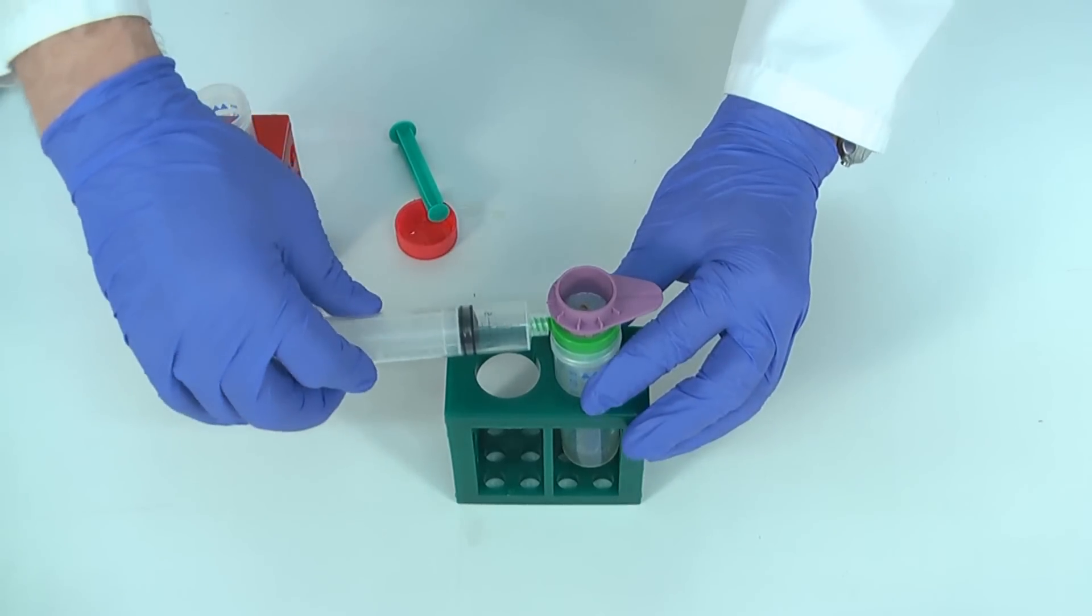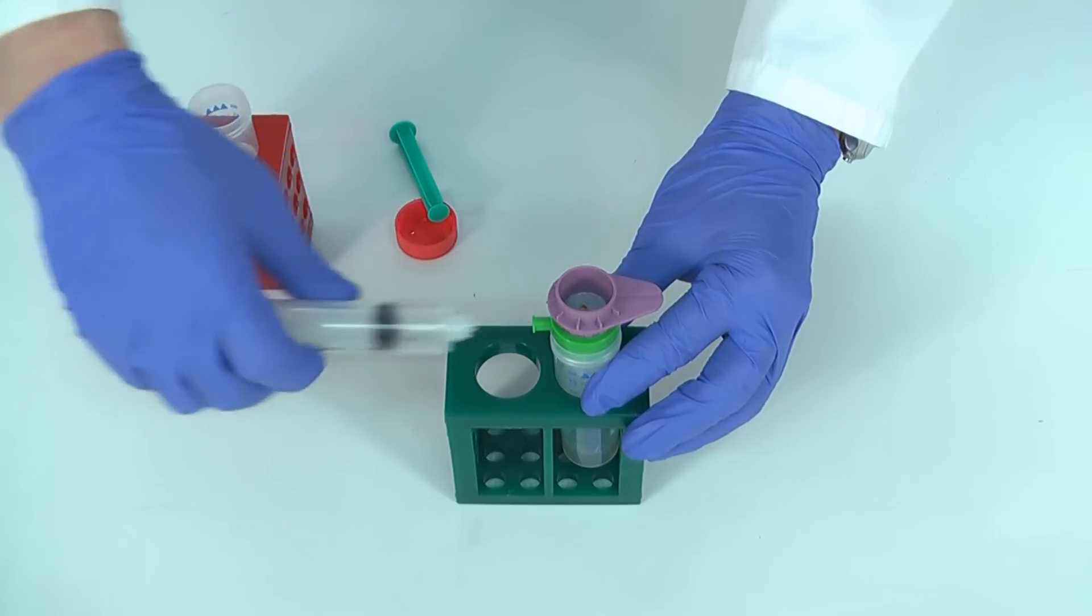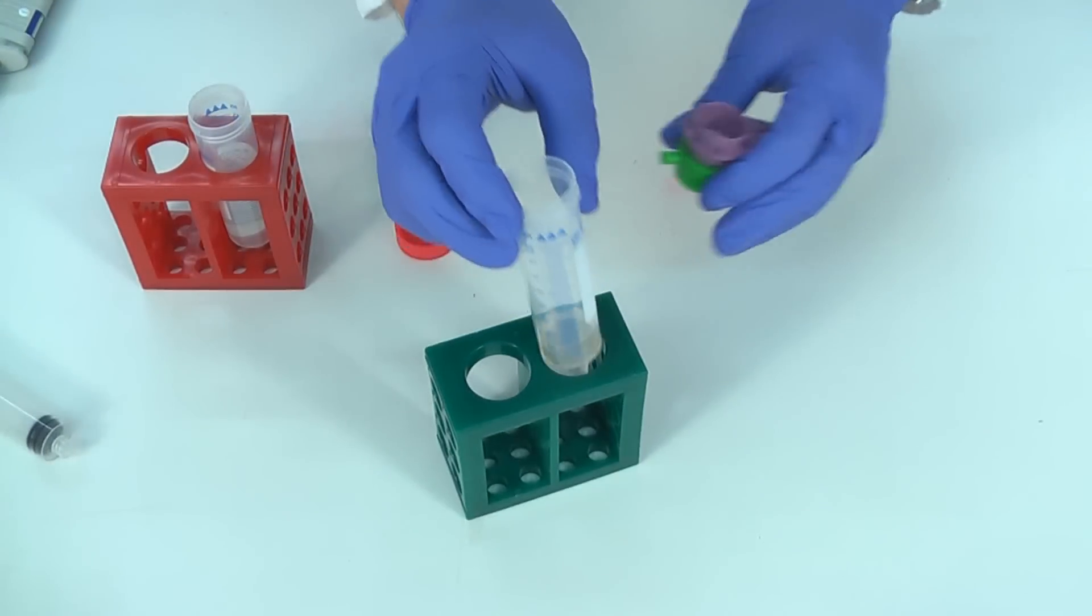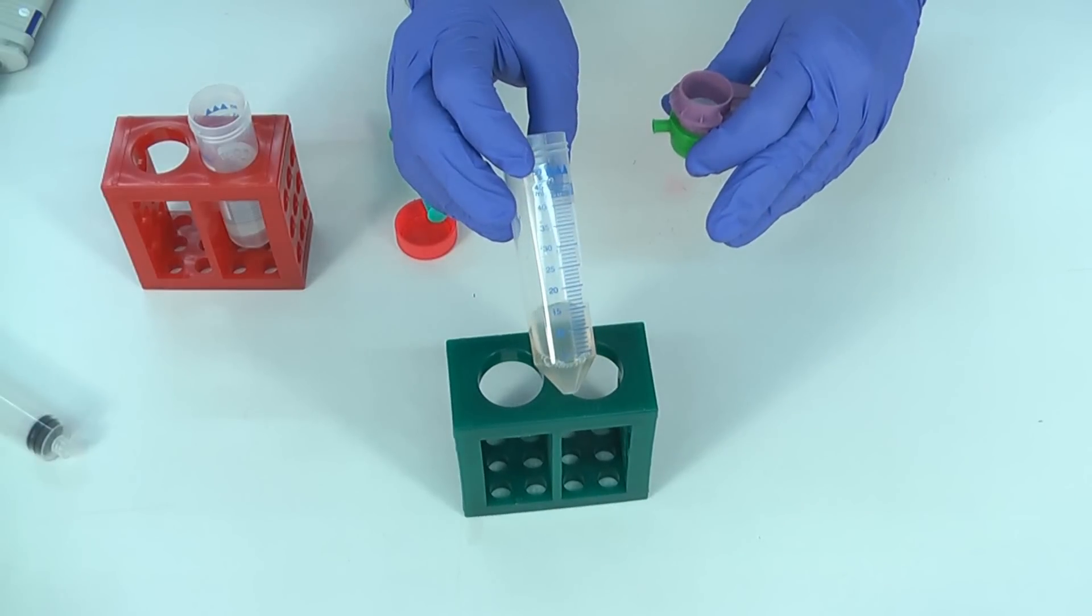Finally, you have your spleen cells in the tube below. You can use them for further application. For example, for cell separation with our pluriBead system to isolate B and T cells.